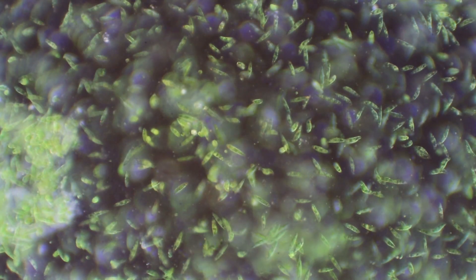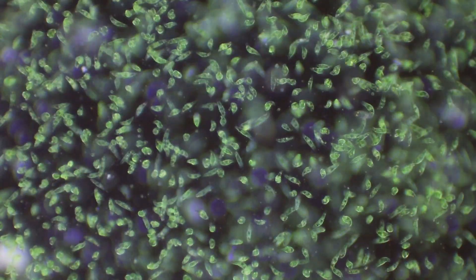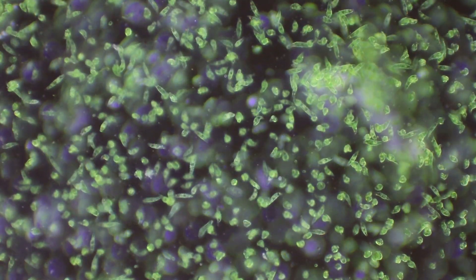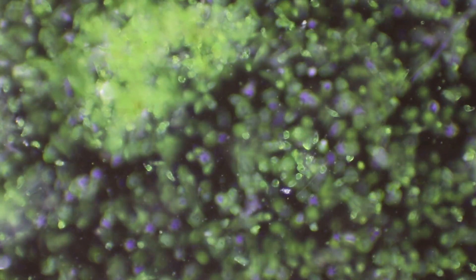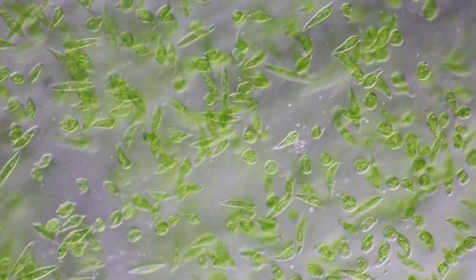But now you can clearly see those areas where they've been stuck together. This is now in oblique illumination — a very extreme oblique illumination, so it's more like dark field than actual oblique.